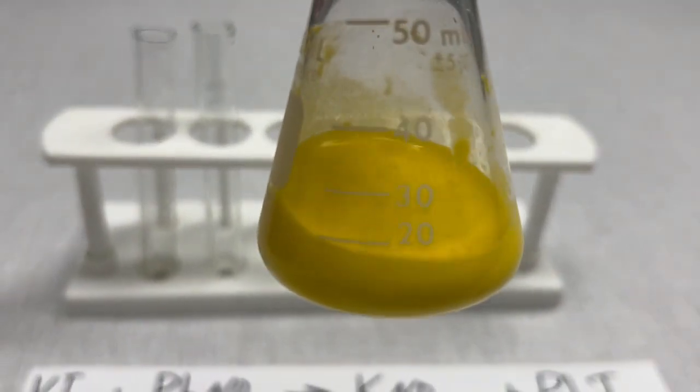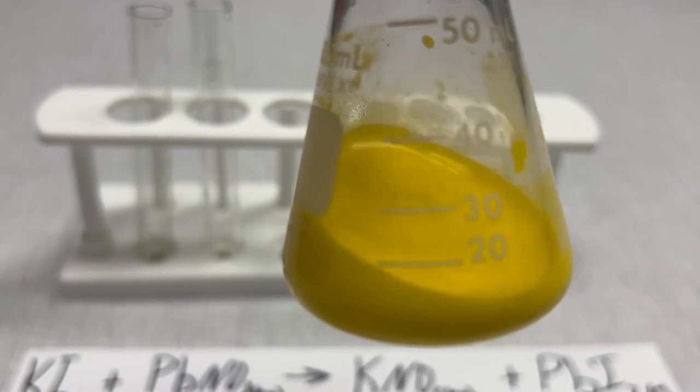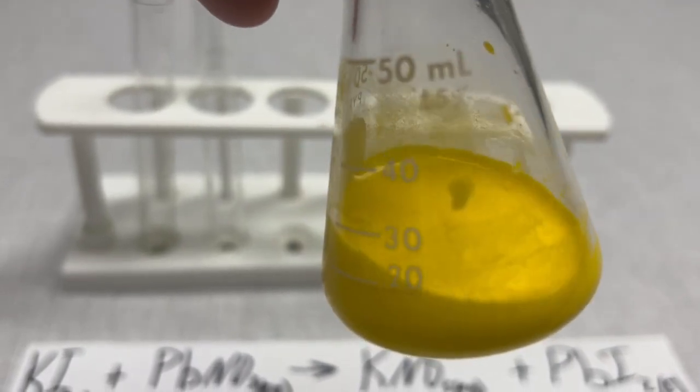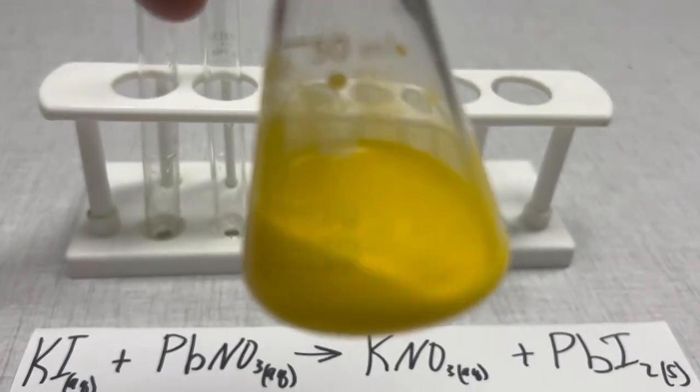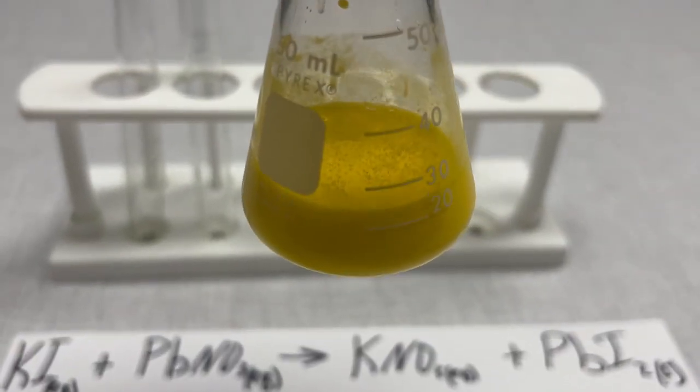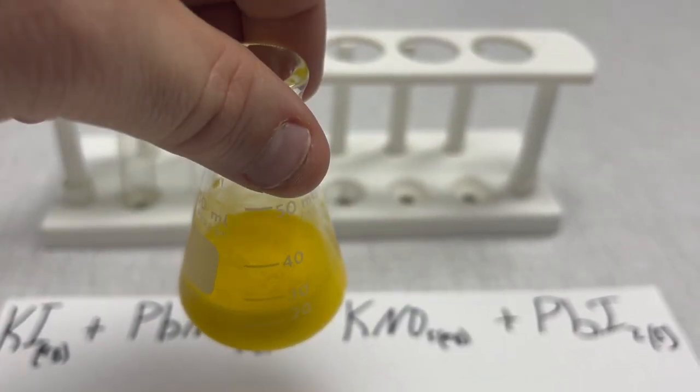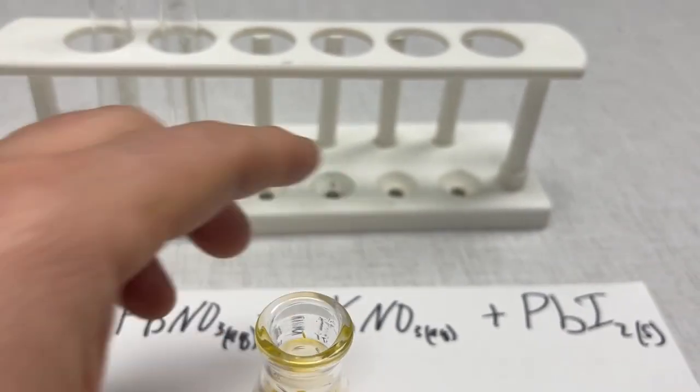And if I swirl it you can almost see that the yellow is actually a solid. It is sticking to the side of the container. There's still liquid in here but there's like a really fine powdered solid in here, and I'm going to leave it sit and maybe we'll actually see it settle out as we talk about some additional things over here.